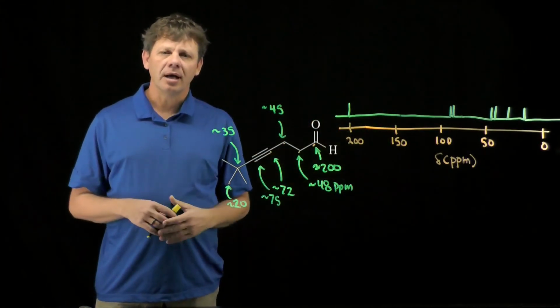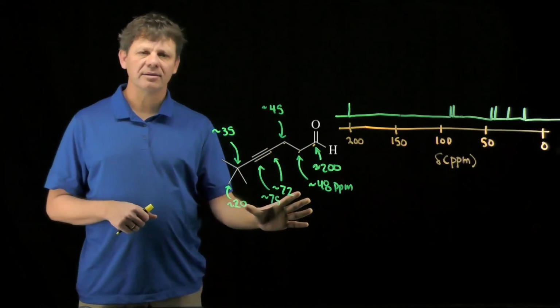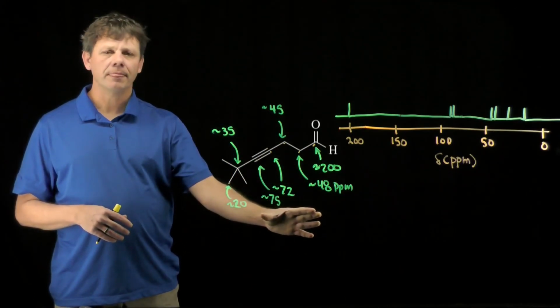This is a spectrum that would approximate what we would expect to see taking a C13 NMR of this molecule.